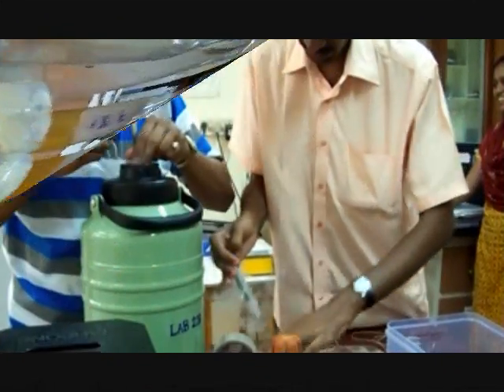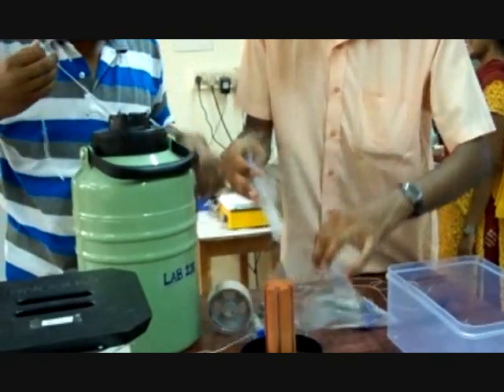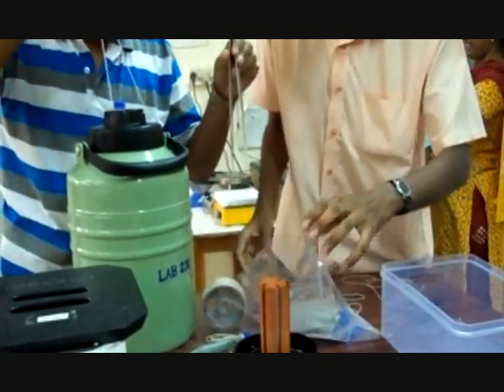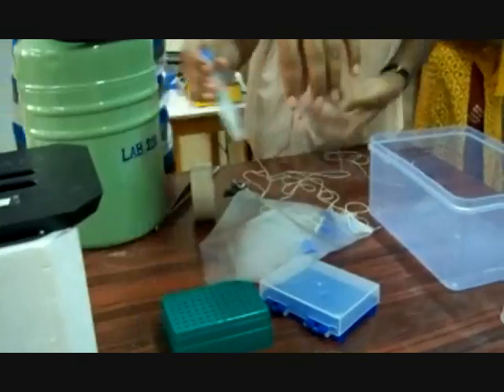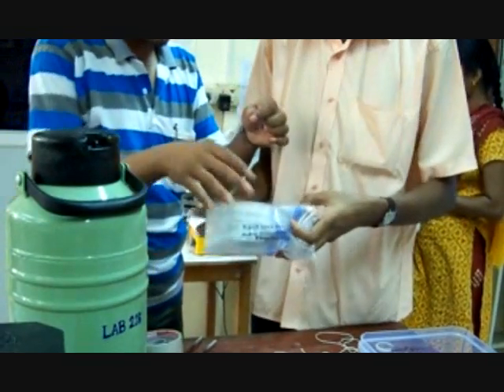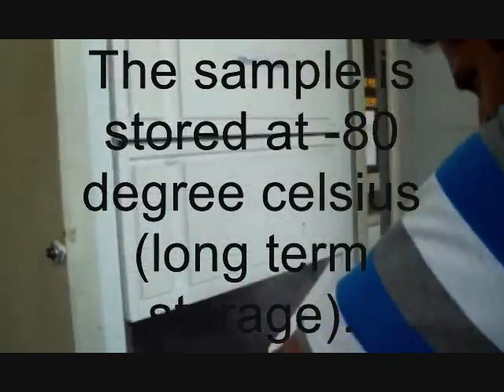Let us see how to store the samples. The samples are harvested from the liquid nitrogen and properly labeled for storage. They are properly sealed and labeled for long-term storage. The sample is stored at minus 80 degrees Celsius for long-term storage.